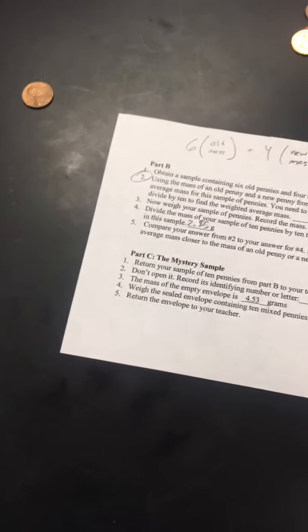Everybody, we're going to be doing number 10. Within this envelope there are 10 pennies, and your goal is to figure out how many old pennies and how many new pennies are in the envelope. I will let you know if you are correct or if you are close. I know a lot of you are going to be spot on. What I'm going to do is put number 10 on the scale.